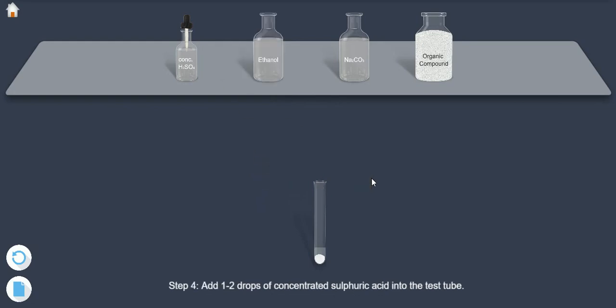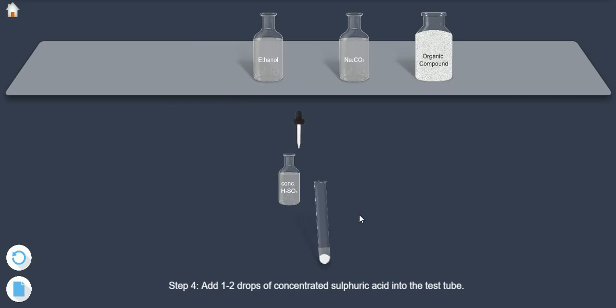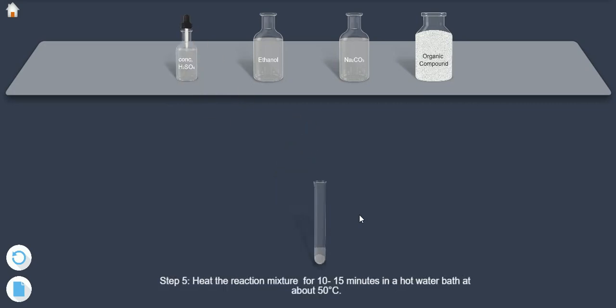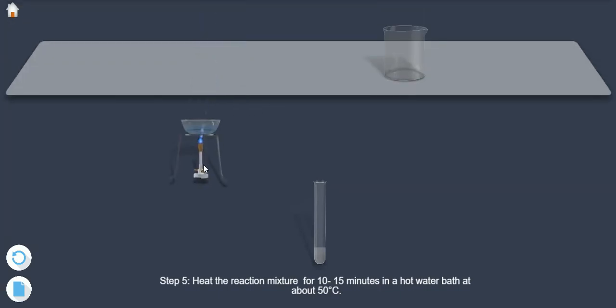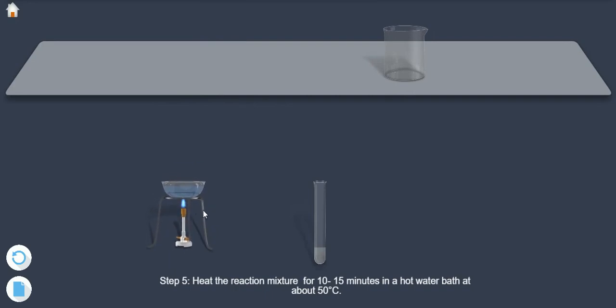Step 4: Add 1 to 2 drops of concentrated sulphuric acid into the test tube. Step 5: Heat the reaction mixture for 10 to 15 minutes in a hot water bath at about 50 degrees centigrade.